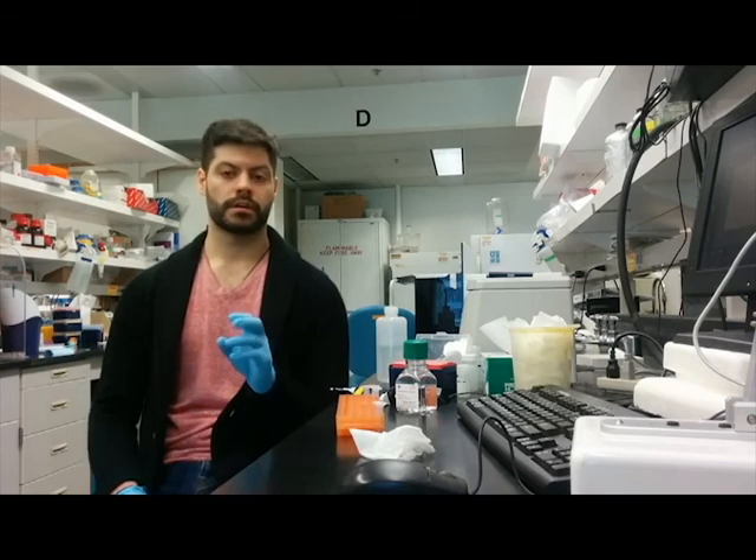Hey guys, Matt here again coming at you from the lab at UCSD in La Jolla, California. This is part two of the first video where I want to show how to do QRT-PCR properly. In that first video I showed how to isolate RNA, and in this second video I want to show how we can determine whether or not it's pure and good quality, and also the concentration. Then I'm going to show how to do the reverse transcriptase reaction so we can get cDNA out of our RNA.